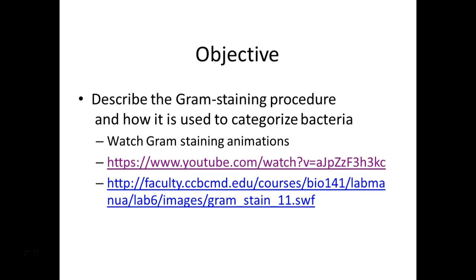Next thing we're going to talk about is probably one of the paramount procedures in microbiology. It's the gram stain. It's the one thing, if you leave this class and you don't know, you will see me cry. I'm not ever going to shut up about it for the rest of the semester, or the summer session in this case. It is that important.